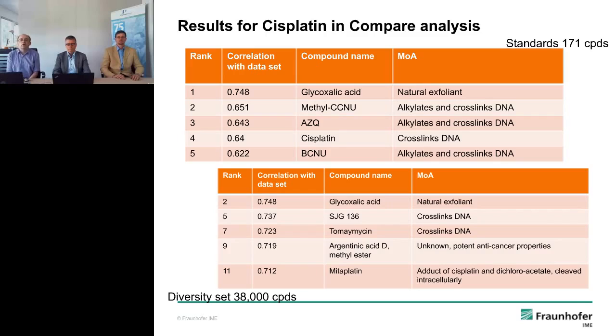So using these classical techniques like ATP determination, profiling multiple cell lines, you're able to get to a point where you can potentially identify compounds with interesting mechanisms of action, and then use that later on to select the compounds which you want to progress within the program.